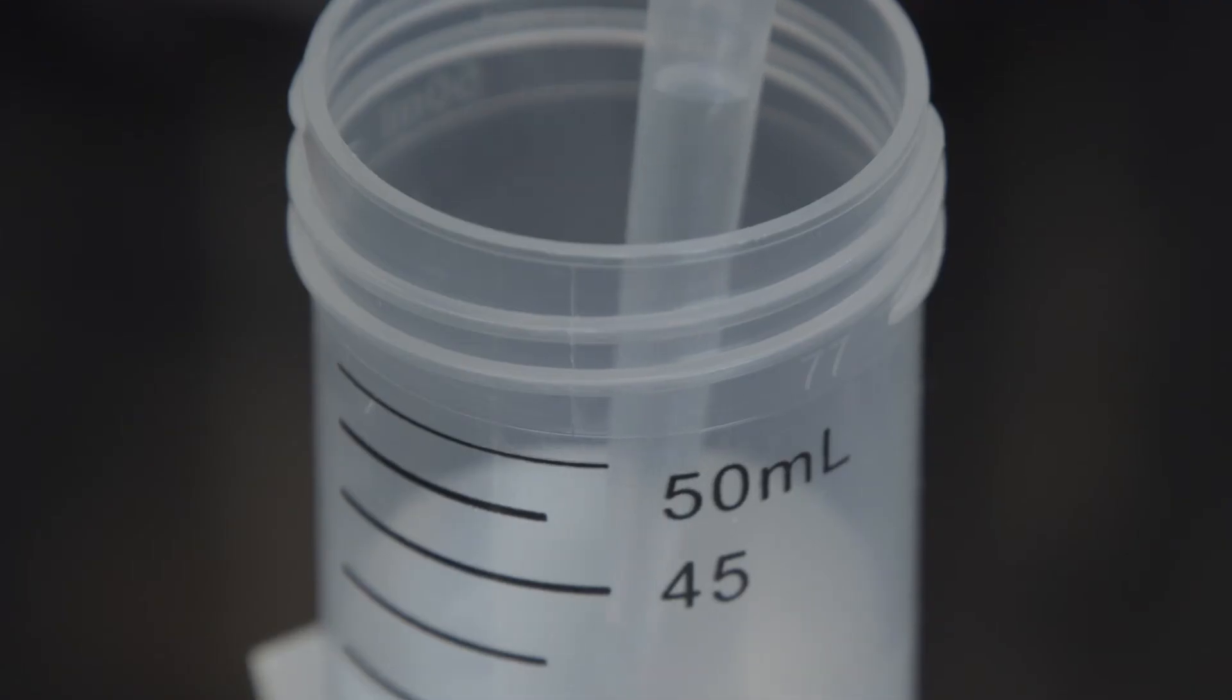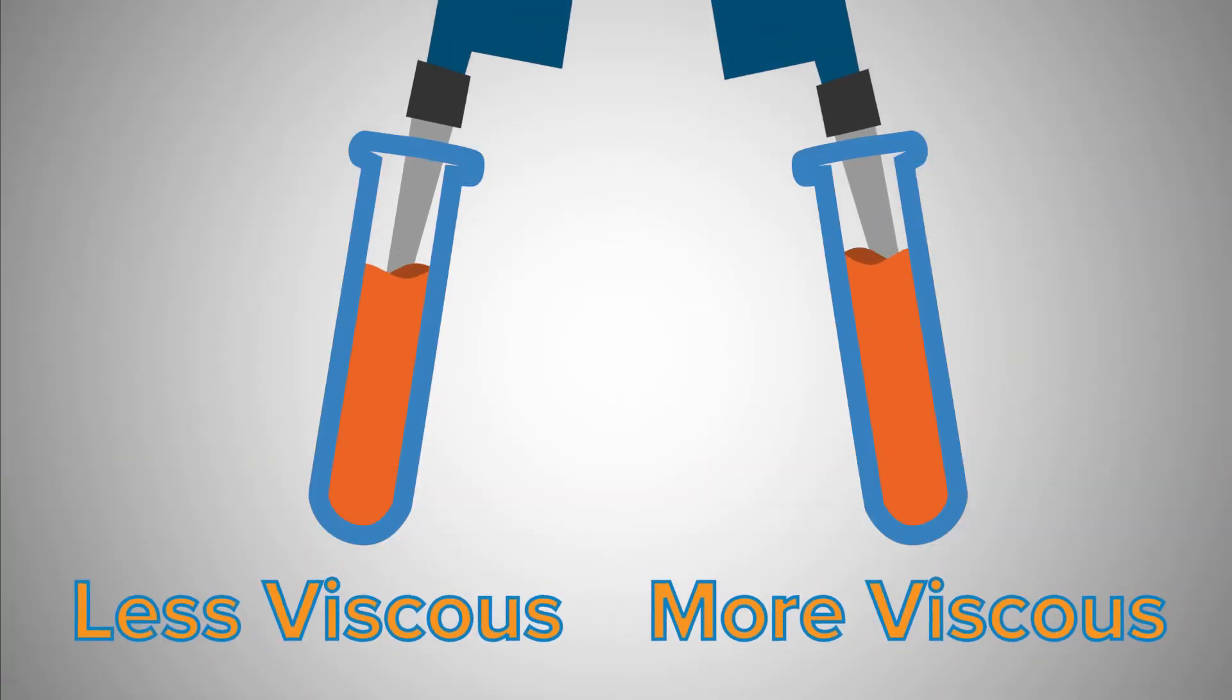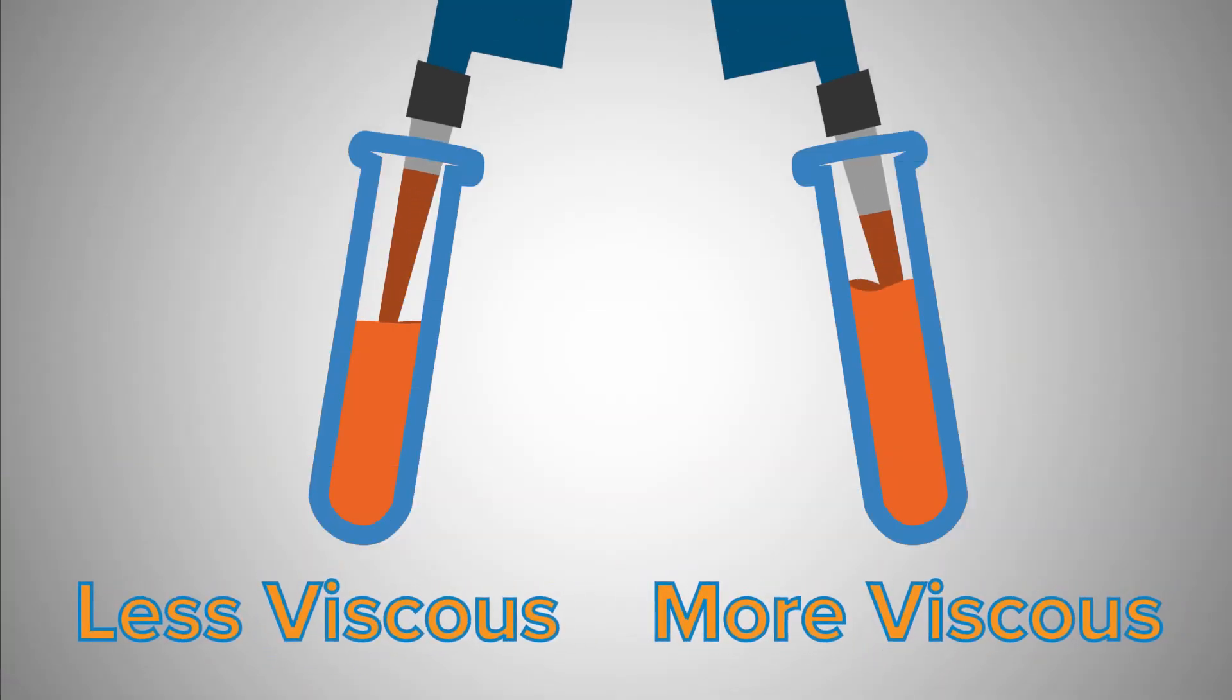Wait until the liquid is finished flowing into the pipette tip. Keep in mind, the more viscous the liquid, the lower the flow rate into the pipette tip.